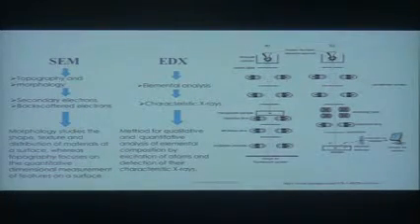EDX, so this is energy dispersive X-ray spectroscopy. Here, this will give you actually elemental analysis. So it goes beyond the surface morphology and gives you some elemental information. It's a little bit more complicated. I won't go through it today, but it's very useful. So usually EDX is something that's added onto an electron microscope. And so we use it.